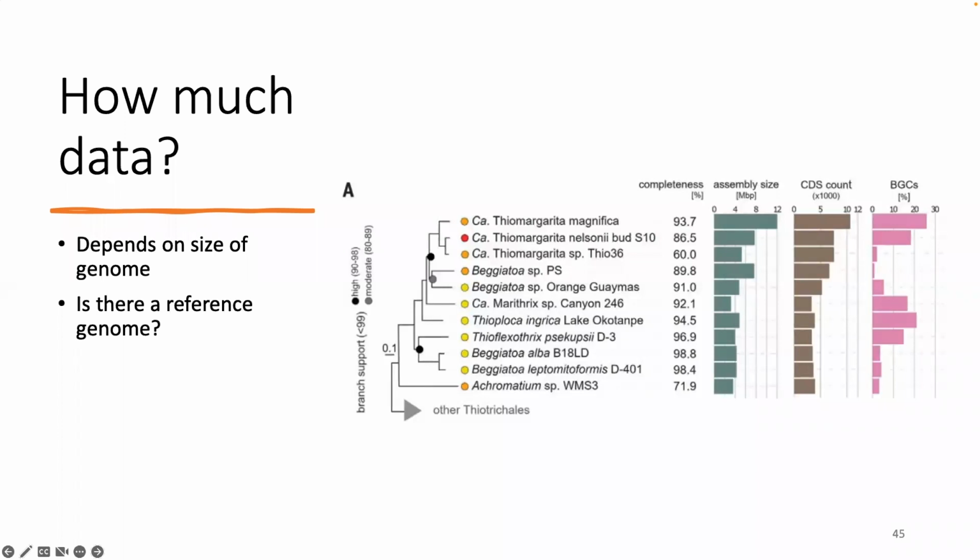So if you have 1 gigabase of data output for most species of bacteria, this will be enough to cover it at least 100 times. For fungi, it's a little bit different. They can have pretty large genomes. Because they're not only larger genomes but also a little more complex and can be polyploid, typically you would cover a little bit higher, so 150 to 200x coverage.